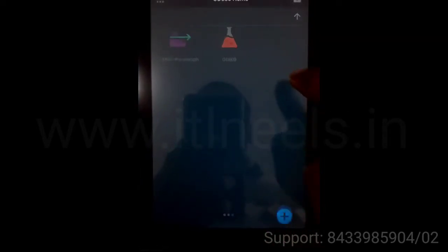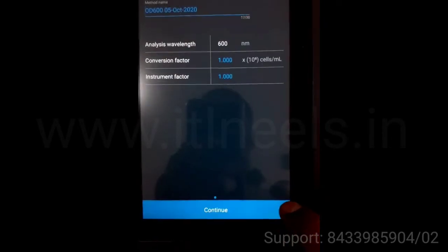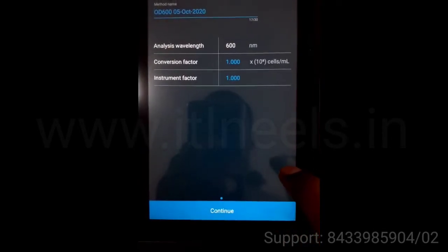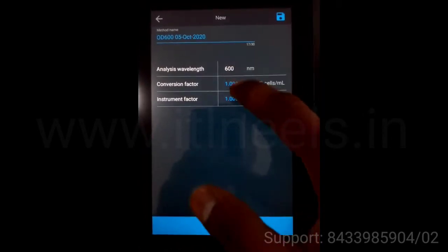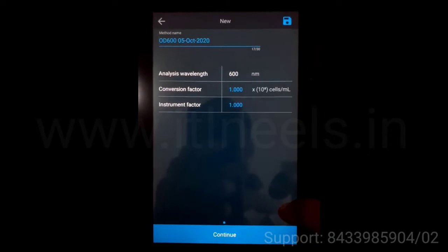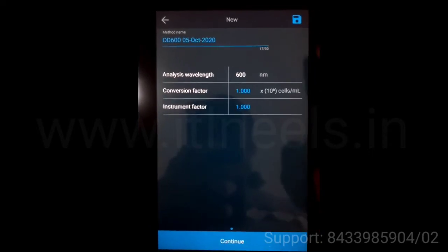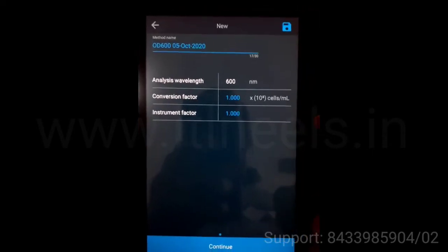This is OD600. To create a new method, you have to press the plus button. You can make the changes and save the method.